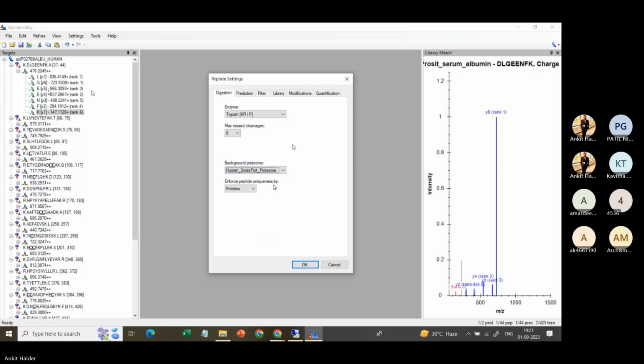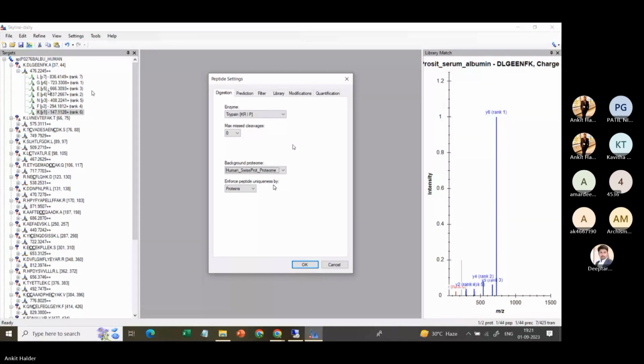We will give the instrument that we will select this particular precursor and find out these particular fragments. And what we will do is that the instrument will give us the result. Whereas in that primary data analysis, we have already generated in the global data the ions, and now we have the data, and then we trace it back which proteins have been identified from the database.